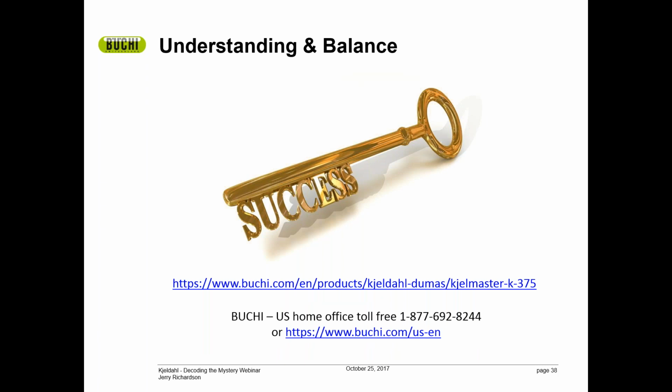An understanding of the chemistry and understanding that that chemistry has a balance, whether it be physically related or based on your sample types, and optimizing your system to fit that.